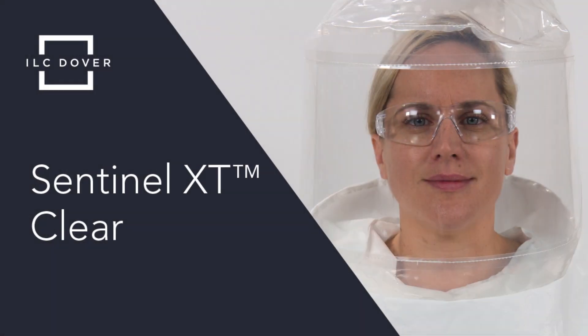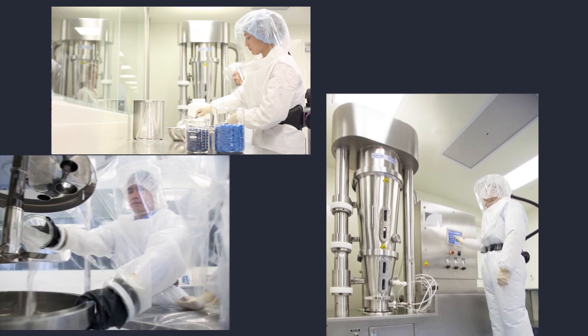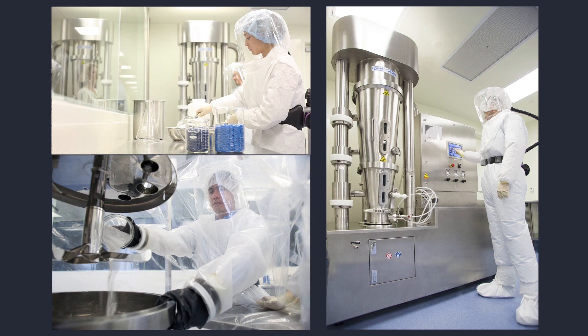Introducing the Sentinel XT Clearhood PAPR System from ILC Dover. The Sentinel XT Clear system is an innovative PAPR specifically designed for life sciences applications, including pharmaceutical, biopharmaceutical, and lab research facilities.